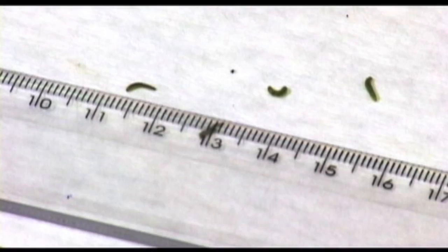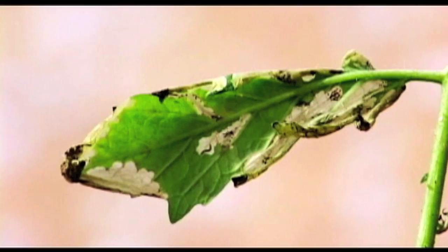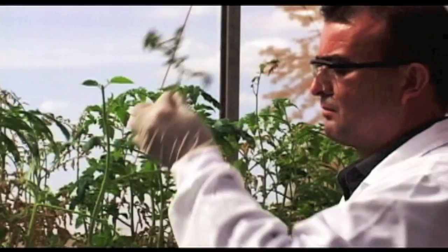We recommend using second larval instar, the offspring from field-collected insects. The leaves infested with larvae should be prepared prior to the beginning of the test, and ideally several hours or even the day before. This is to allow the leaves to start wilting, which causes the larvae to come out of the mines and start moving on the surface of the leaves.